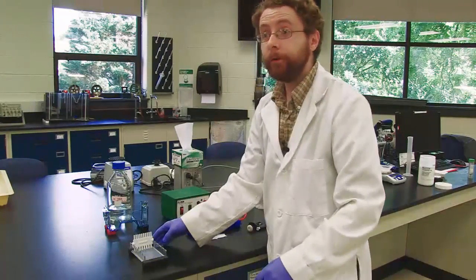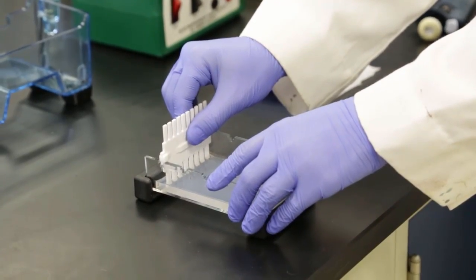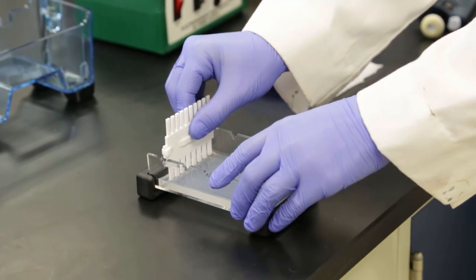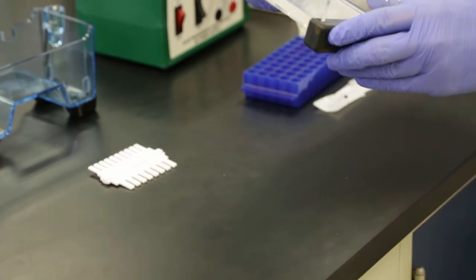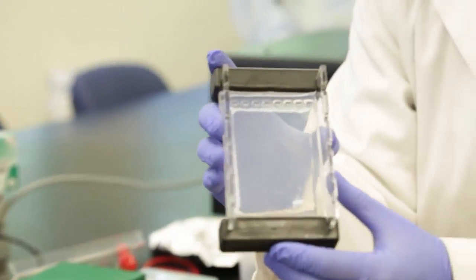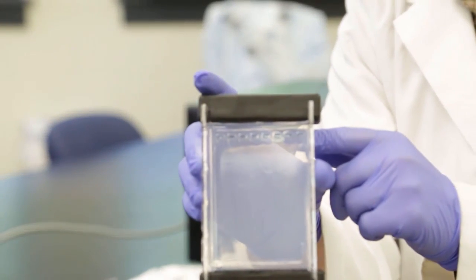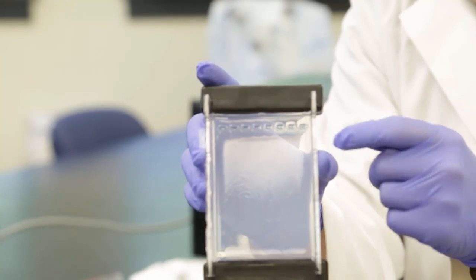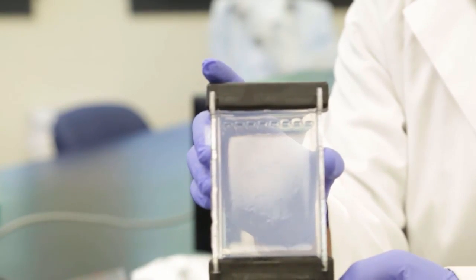First thing I need to do is to remove the comb gently. And you can see that I now have wells in my gel. And it is those wells that we're going to add the DNA.